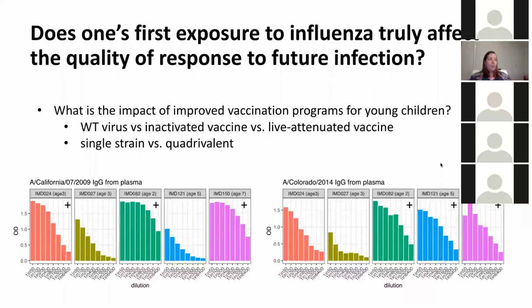So I think we can learn something by understanding these differences of pre-existing exposure, and then what effect that might have on the organoid cultures, either with single strains to these individual groups or in the context of a vaccination.